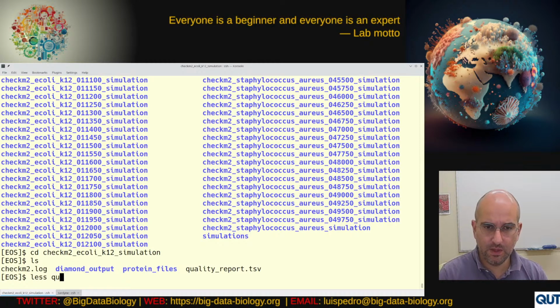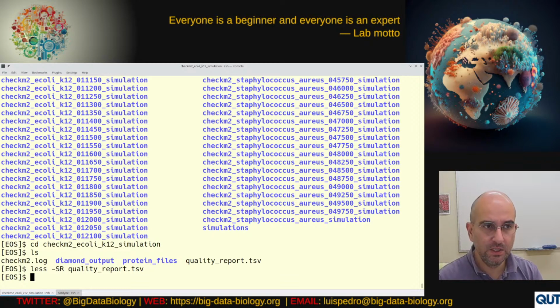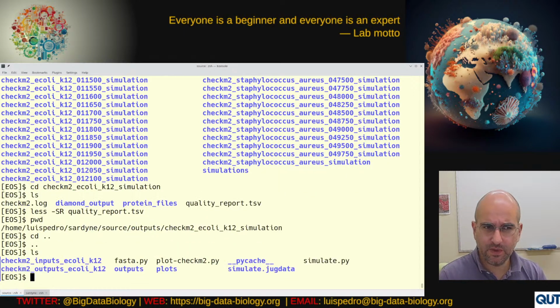I'm going to pick E. coli. I'm not even exactly sure what I'm looking for, but maybe what I'm looking for is a gene. Let's look at genes that disappear with the mutations, these so-called false positives, and see what happens. Or actually, let's just play around with this a little bit. I have a bunch of related questions, including, for example, even the genes that don't disappear, do they become shorter? So let's just play around with this a bit.